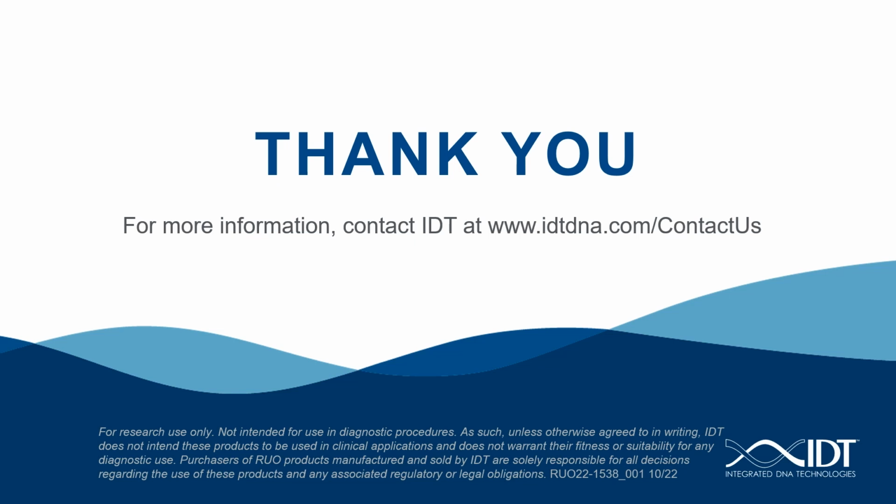Great. Can the master mix be used in direct amplification from other human specimens, such as blood? Although we have shown this master mix has high tolerance towards hematin and heparin, we have not tested amplification from blood, either human or other species.